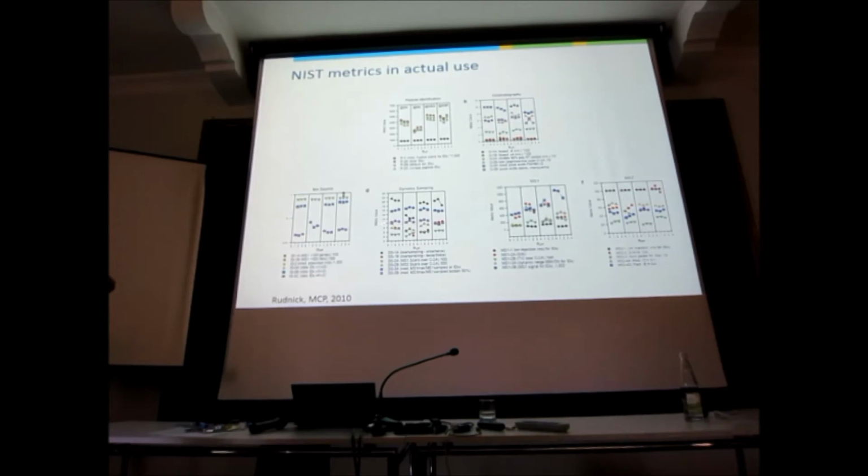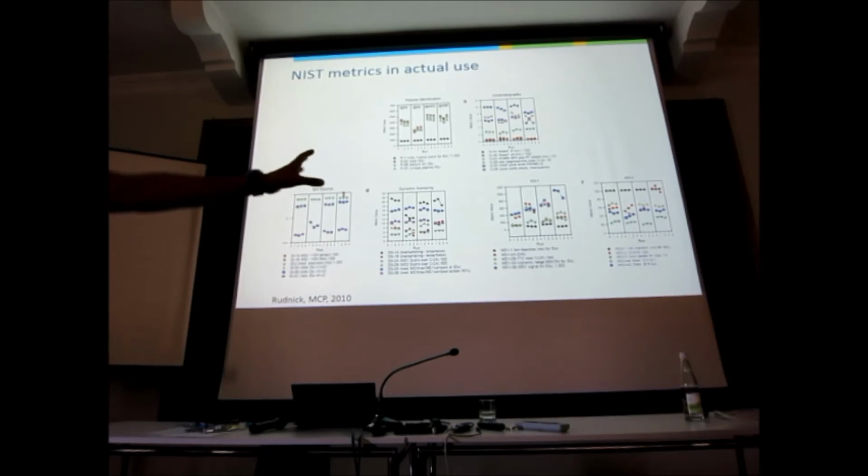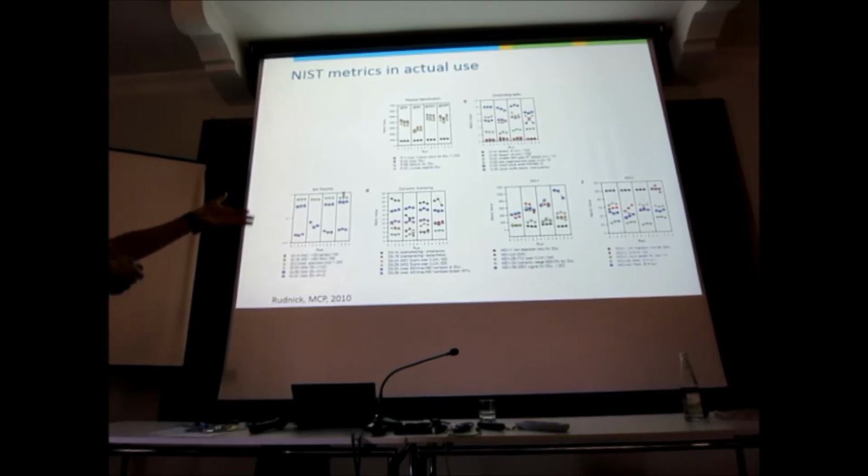And then there's other stuff like dynamic sampling. You see that's a bit screwed up here. You see here the MS1 features and what they tell you, and you see that that is actually not too bad. And then here you see the MS2 features, and that too is not too bad. But these features are incredibly interesting, and they tell you a lot about a lot of stuff. The raw file tells you about your experiment. Even trypsinization is included, but unfortunately everybody did it right here, so you can't blame it. But this is cool. Yeah? This is something that everybody should have all the time, right?